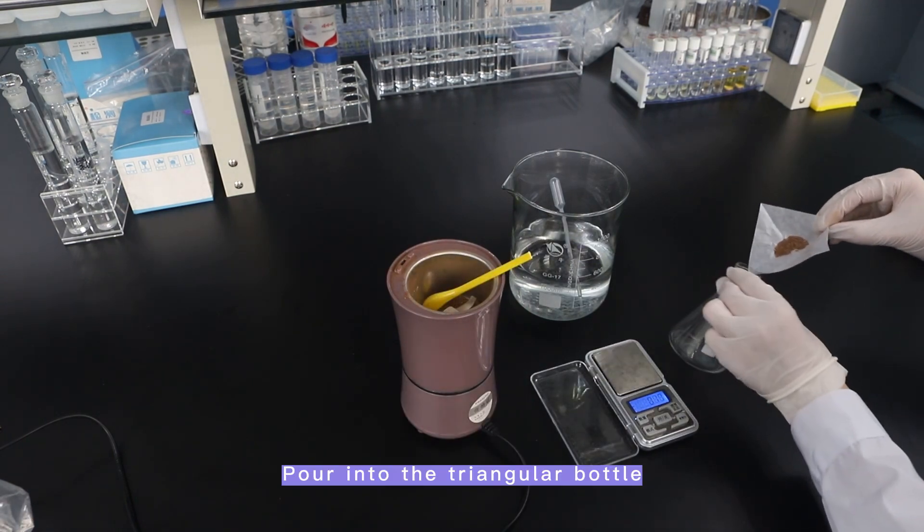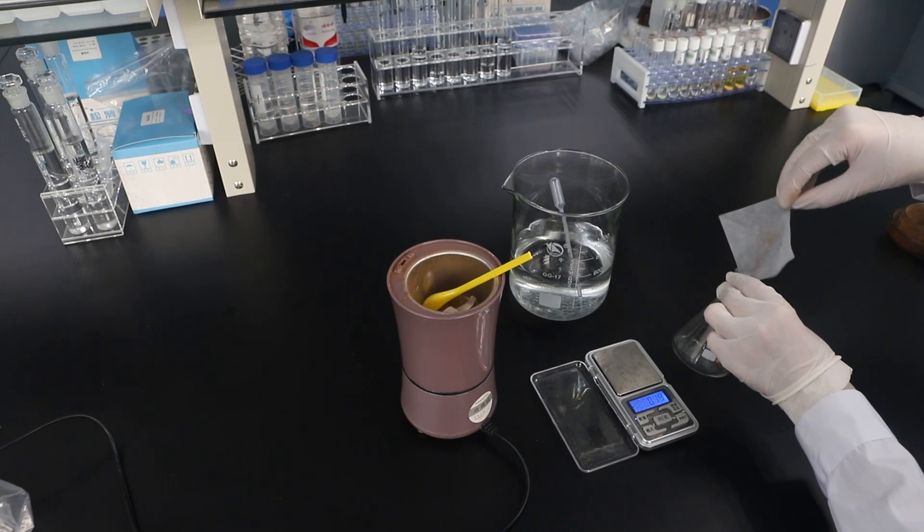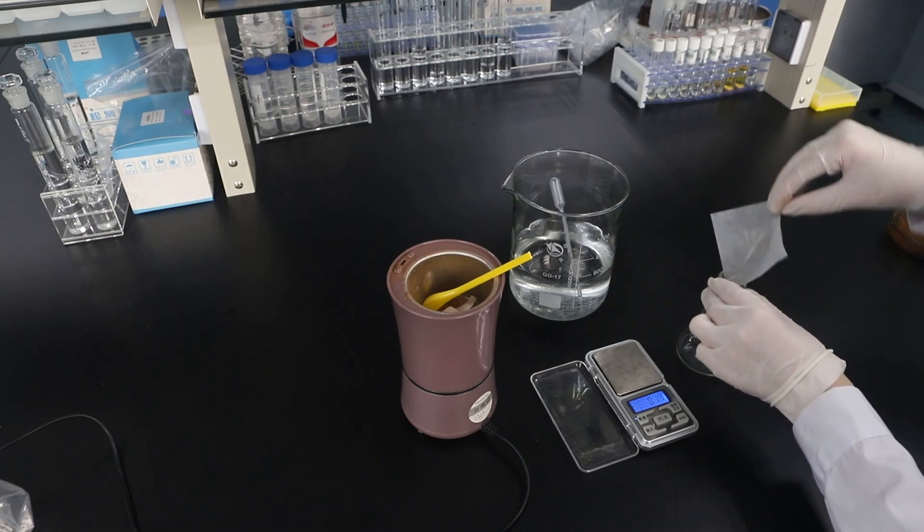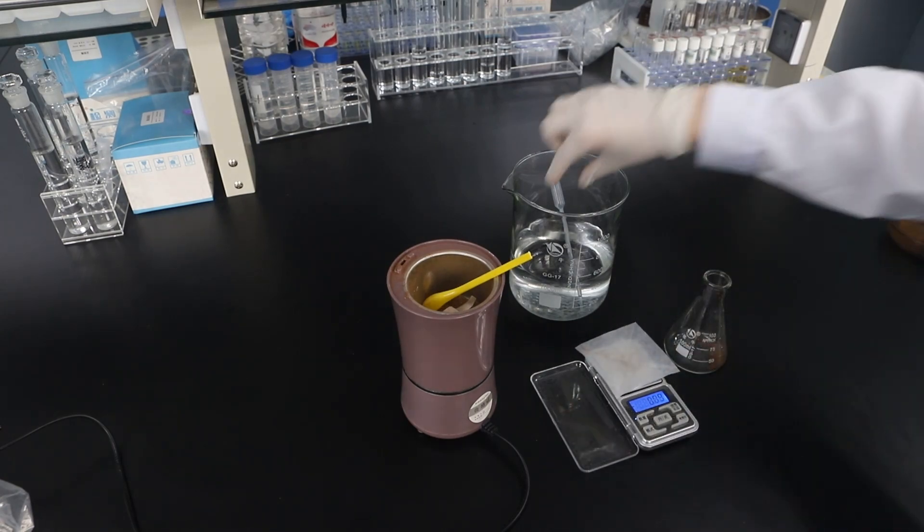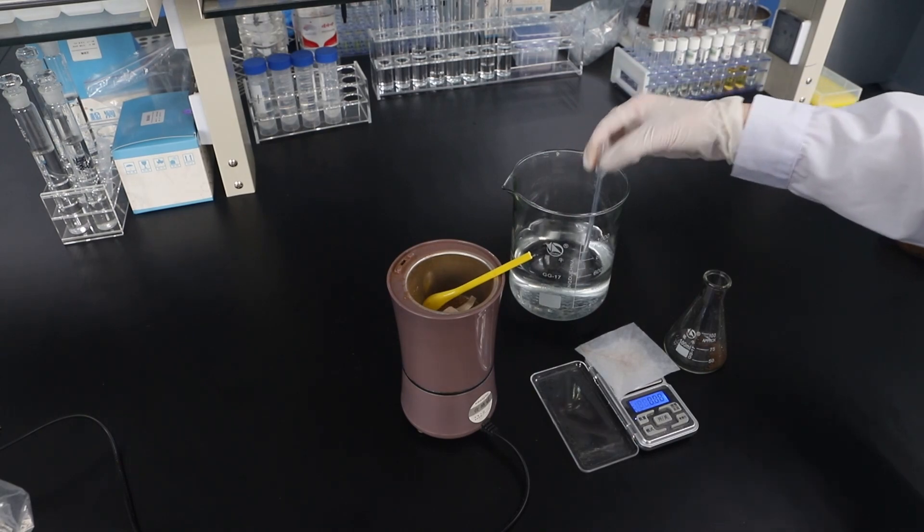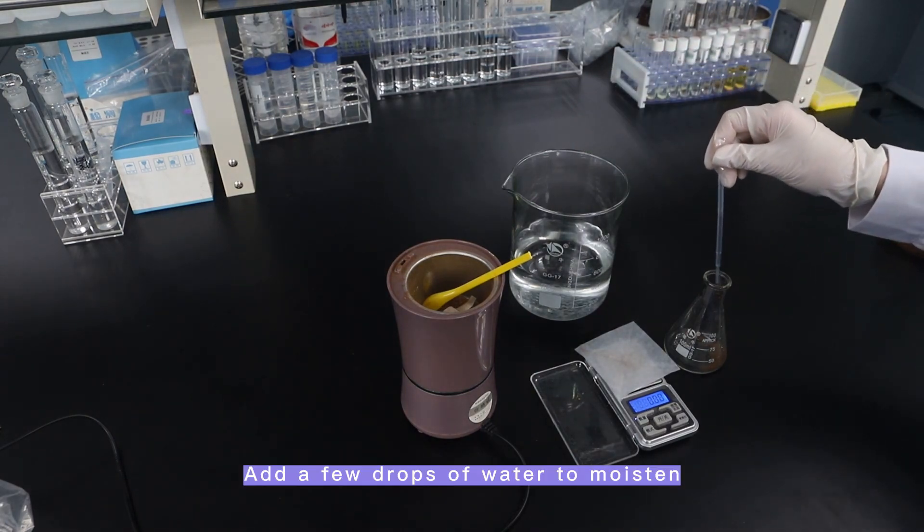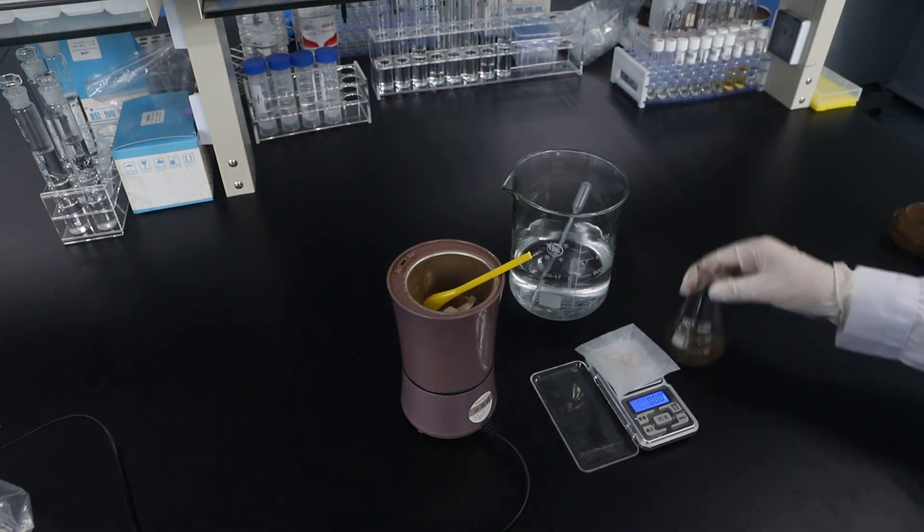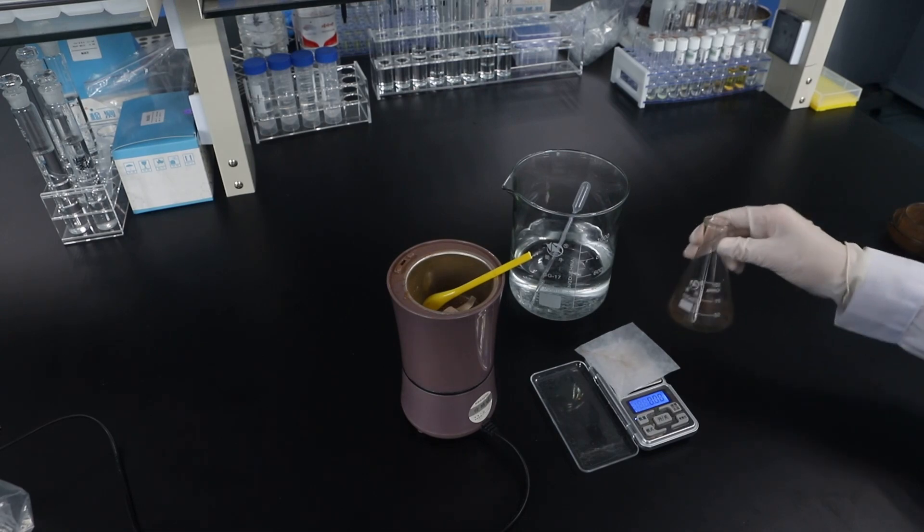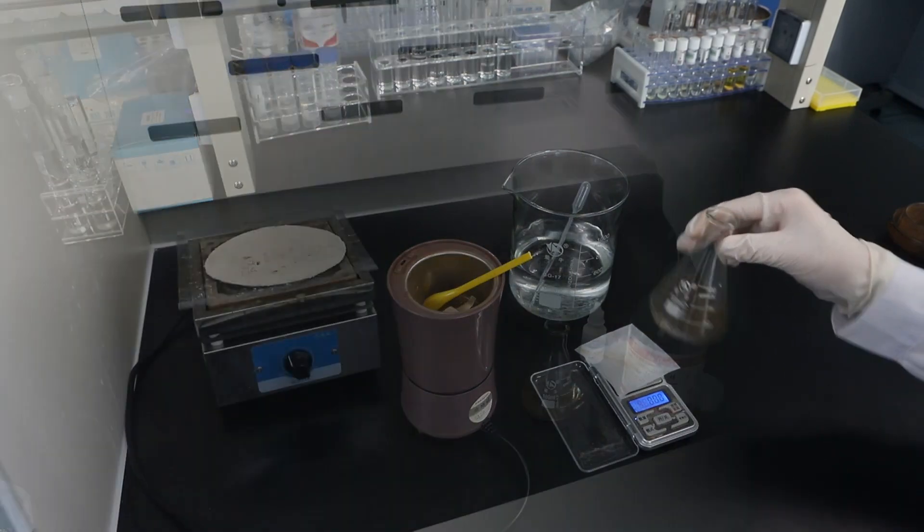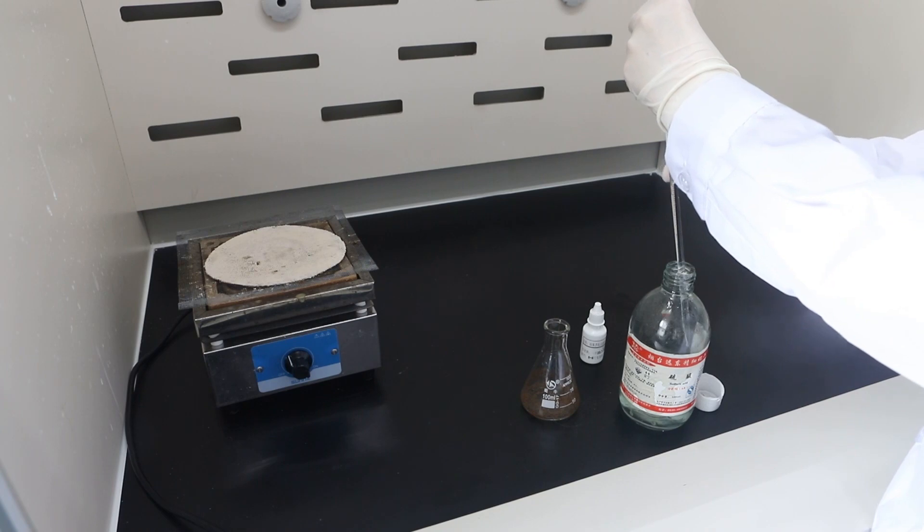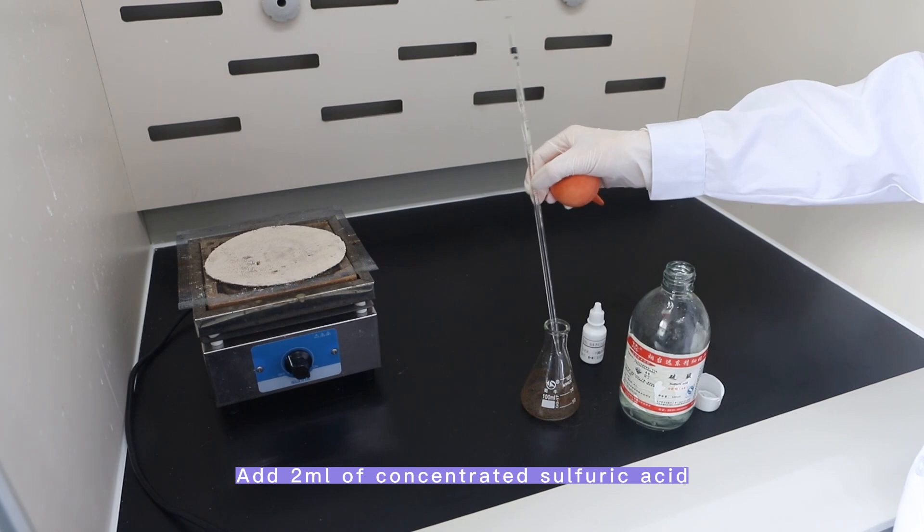Pour into the triangular bottle. Add a few drops of water to moisten. Add 2ml of concentrated sulfuric acid.